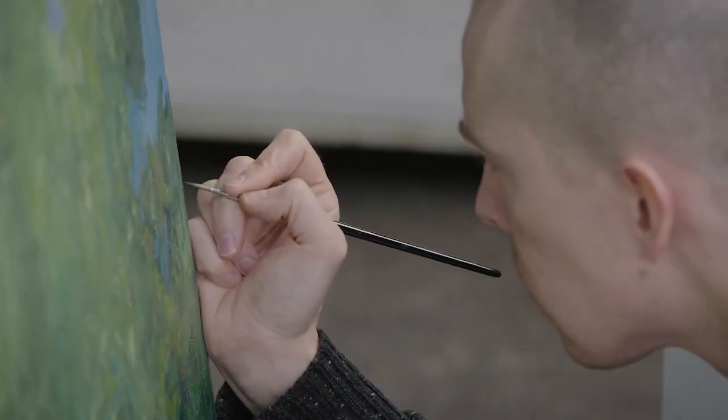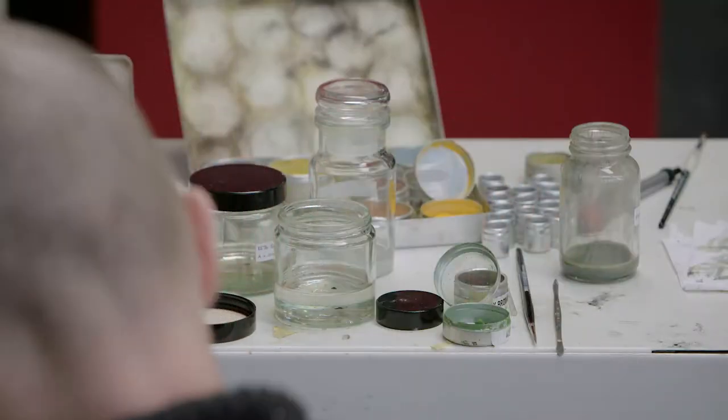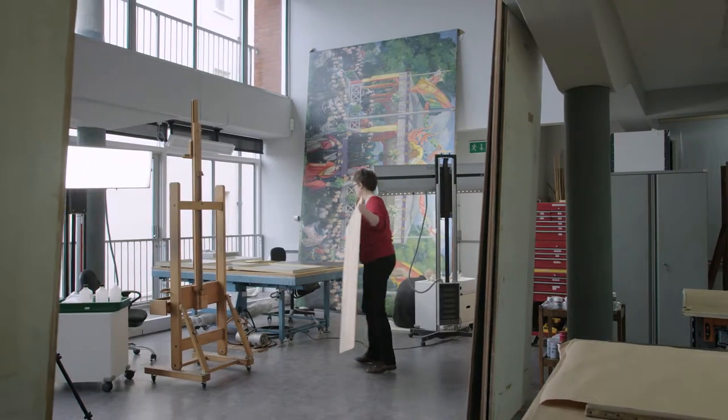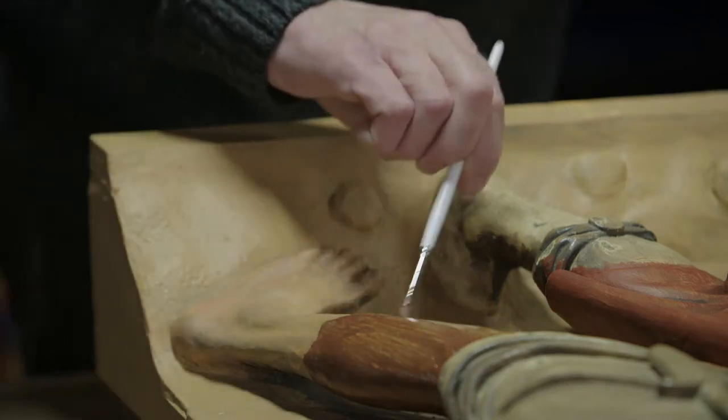The University of Bristol provides a kind of sophisticated method of analysis that can be quite crucial when it comes to authenticating a very valuable painting for instance that may be worth millions of pounds and where there's doubt cast on its authenticity.